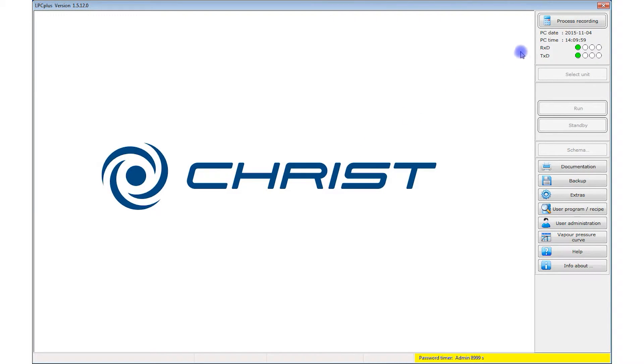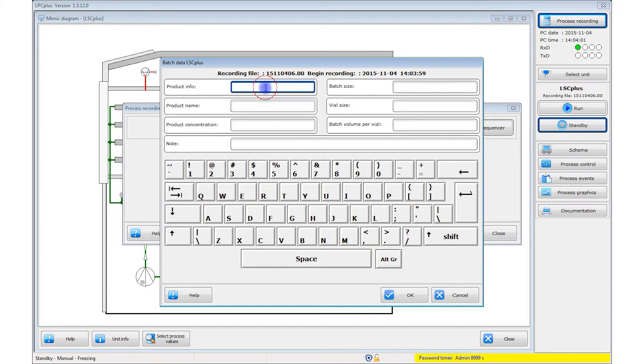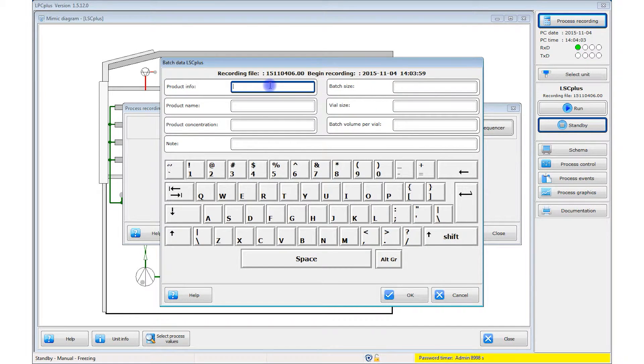The first step in a freeze drying process is to start the process record. The program launches with the start window. Then the batch data window opens.